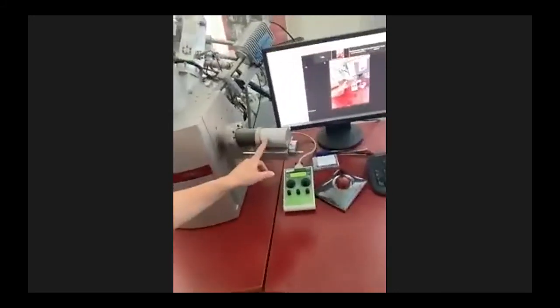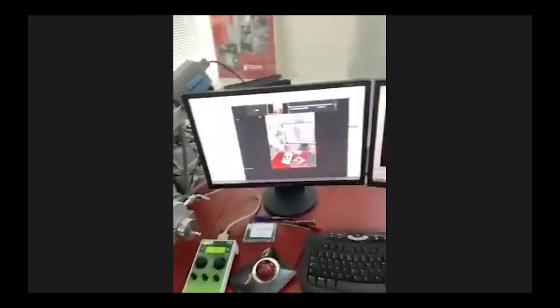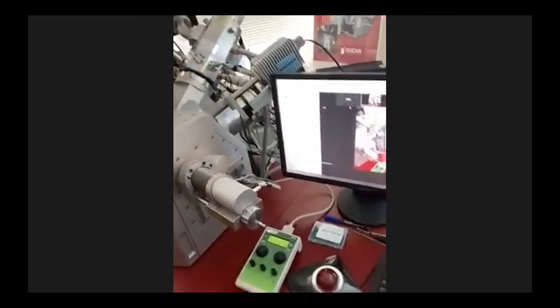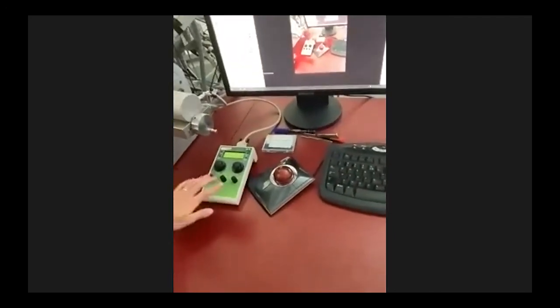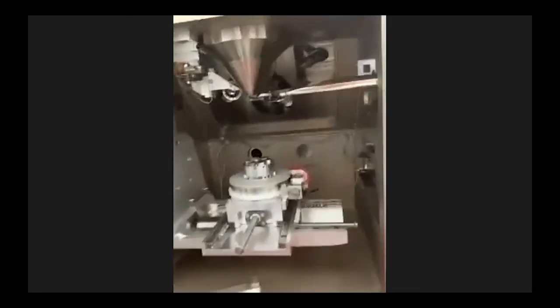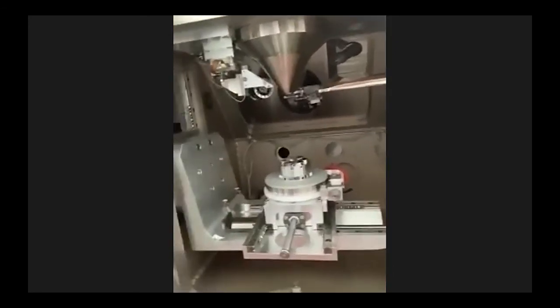So here is a backscattered electron detector. Here is EDX, these Bruker ones. And a secondary electron detector as well. So this is similar. Here is how the operation looks. Moreover, we have the possibility to move with a tip. So how the chamber looks inside. Now it's better because it's much bigger.